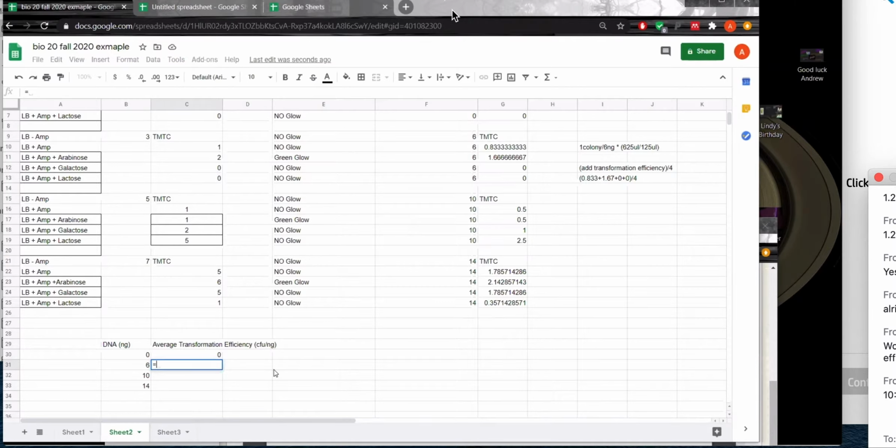Now, again, there's also a super savvy way to do it in Excel and Google Sheets, where you can type in an equal sign, then type out average, put a little bracket, and then select the data you want to take an average of. So I want the average of this one.